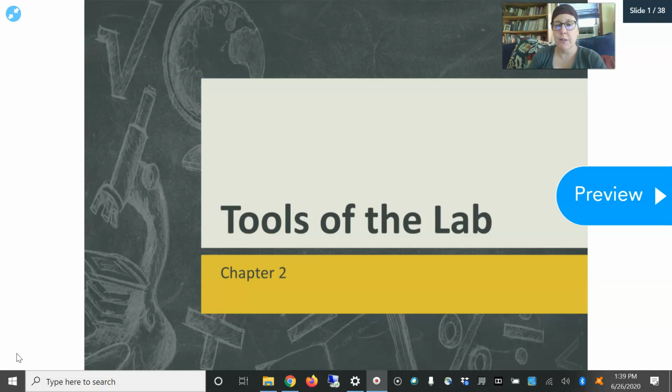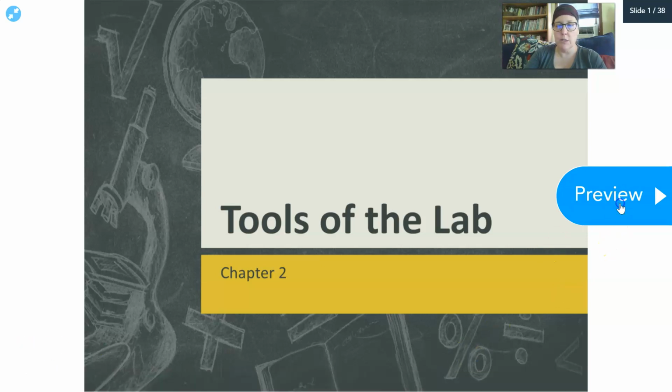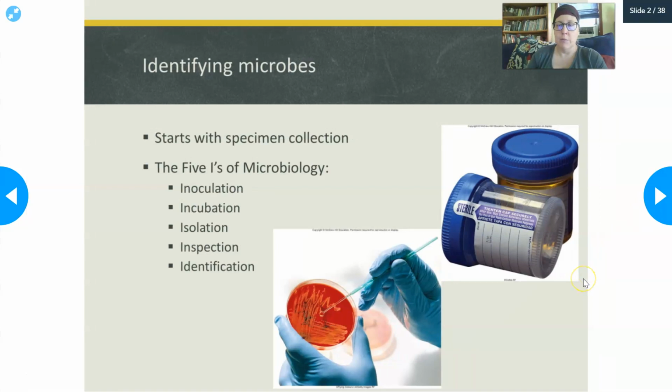This is on tools of the lab, and these are the tools that the microbiologist in the clinical lab uses to identify organisms that are causing disease and problems in patients. So, identifying the microbes that are causing a problem in your patient starts with specimen collection.